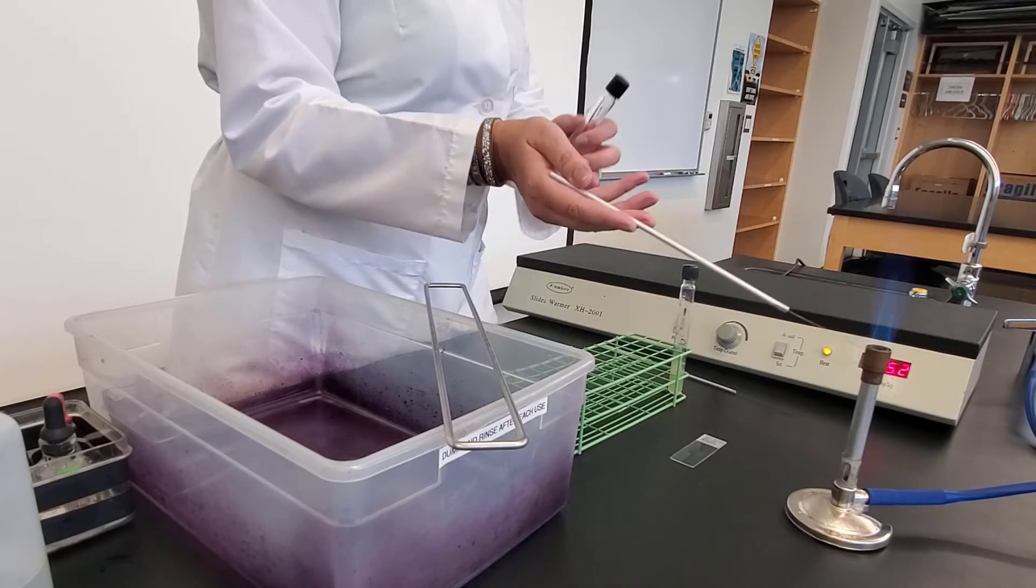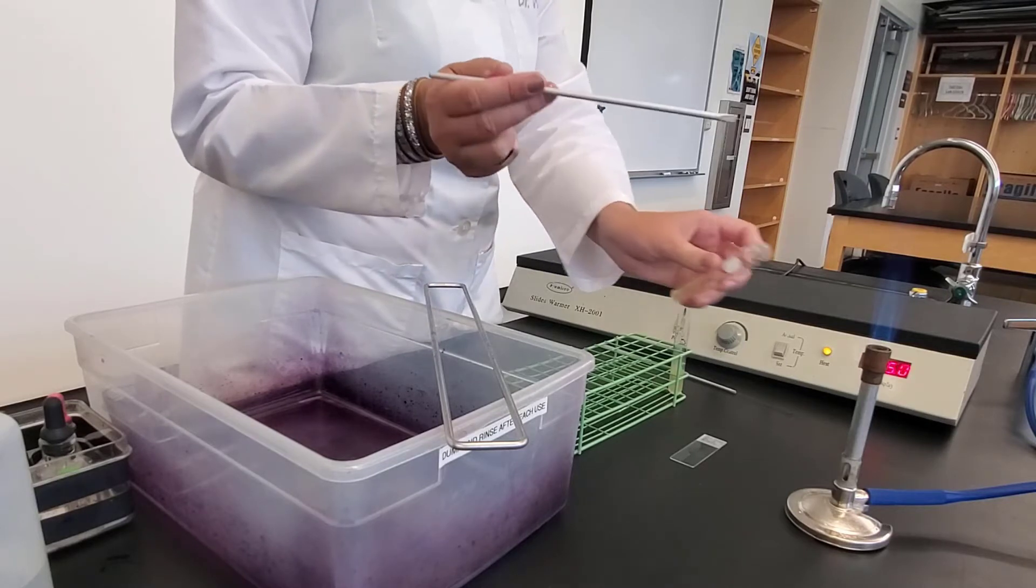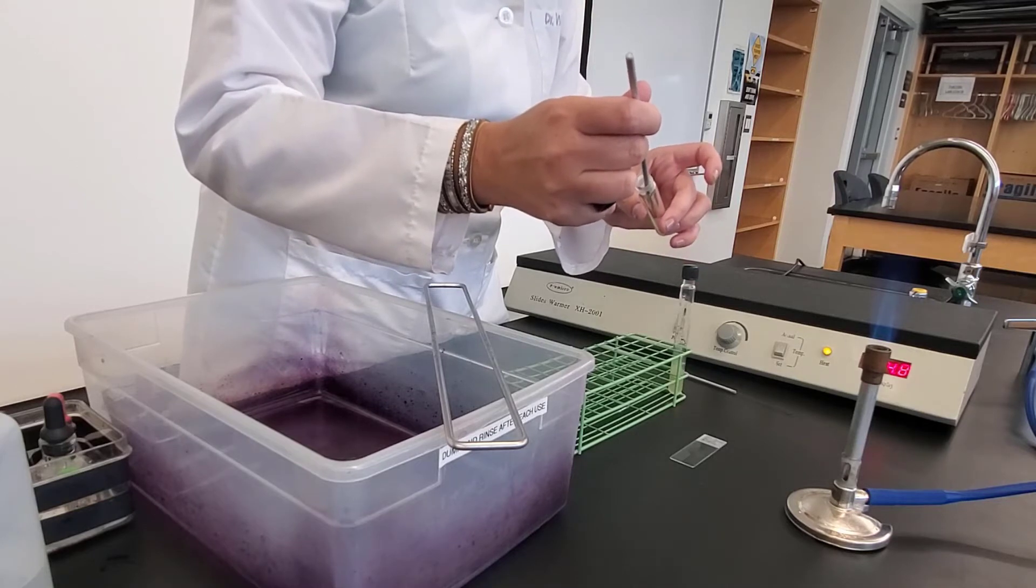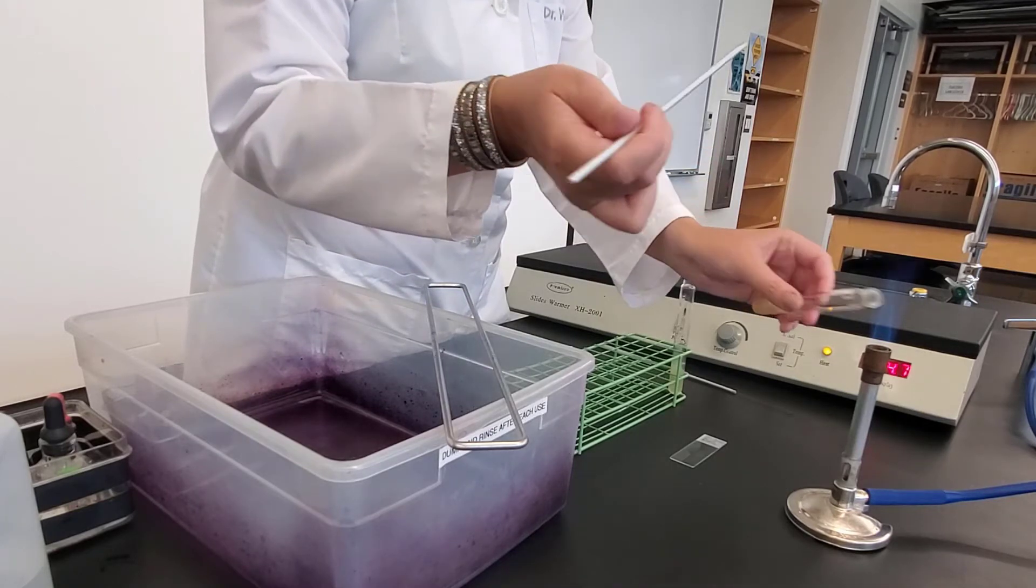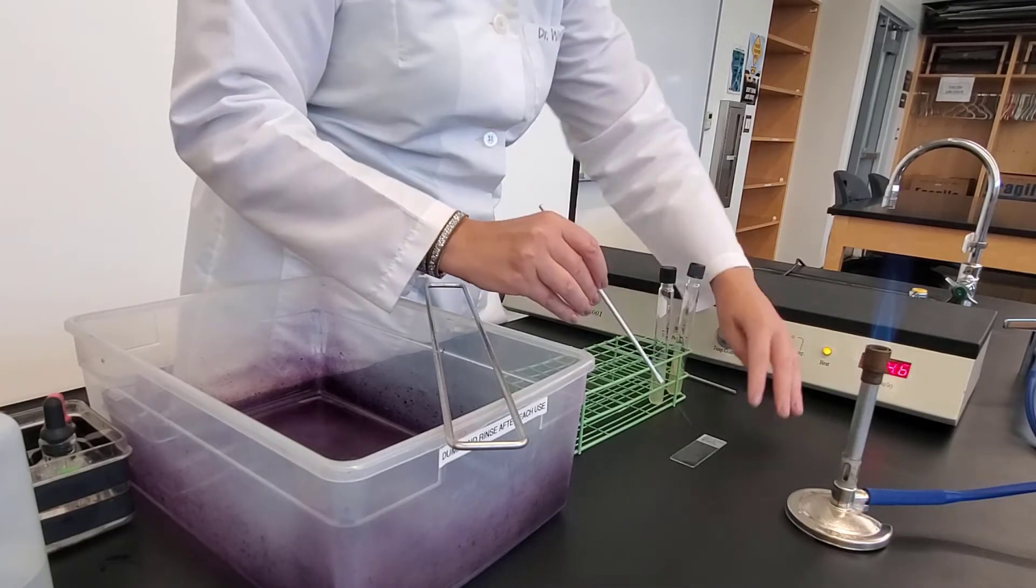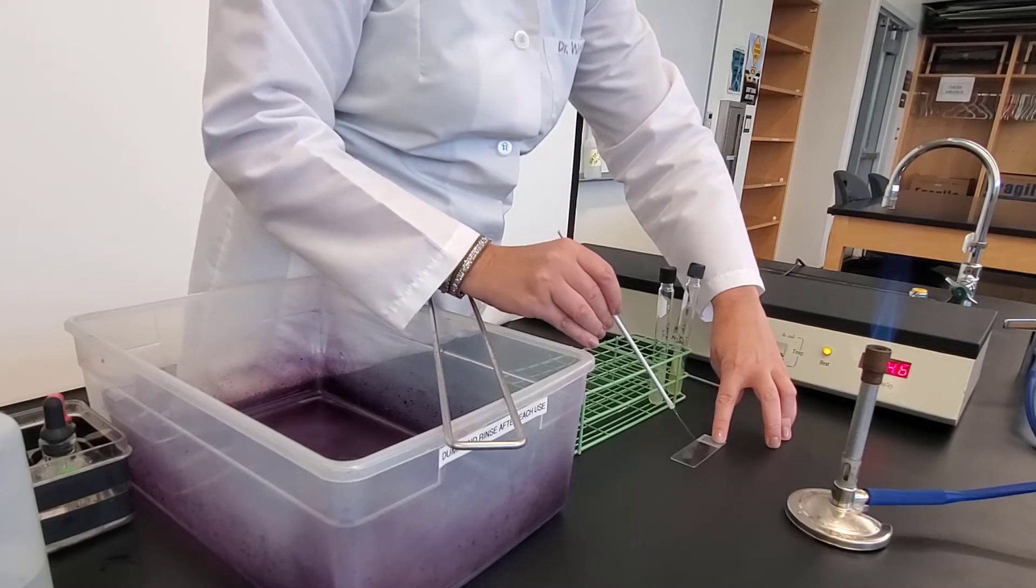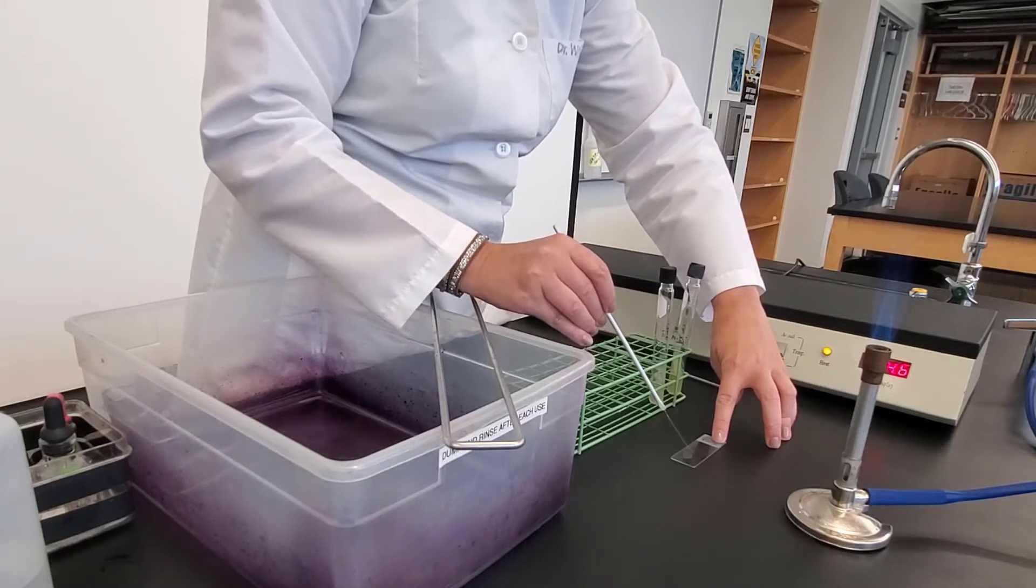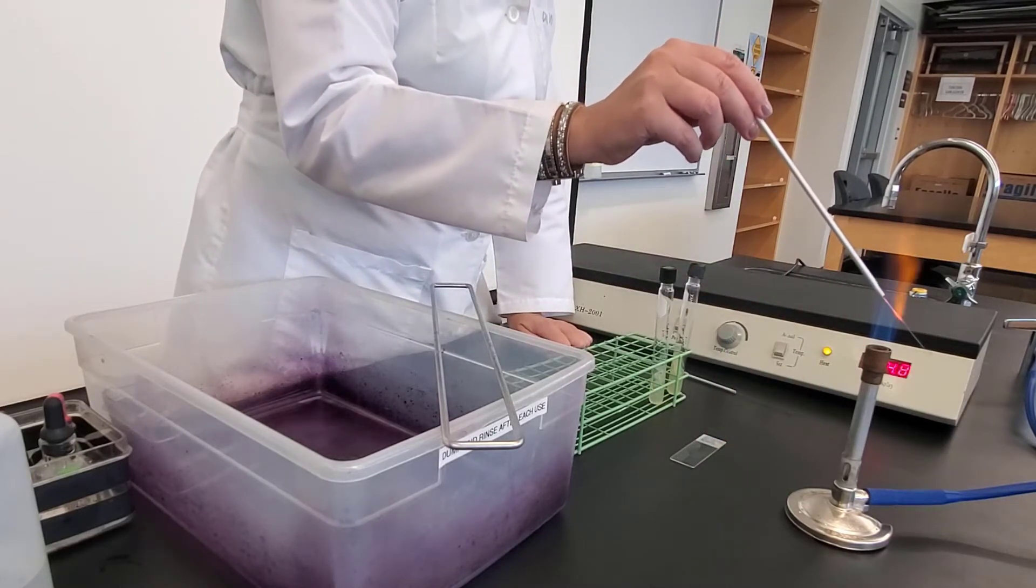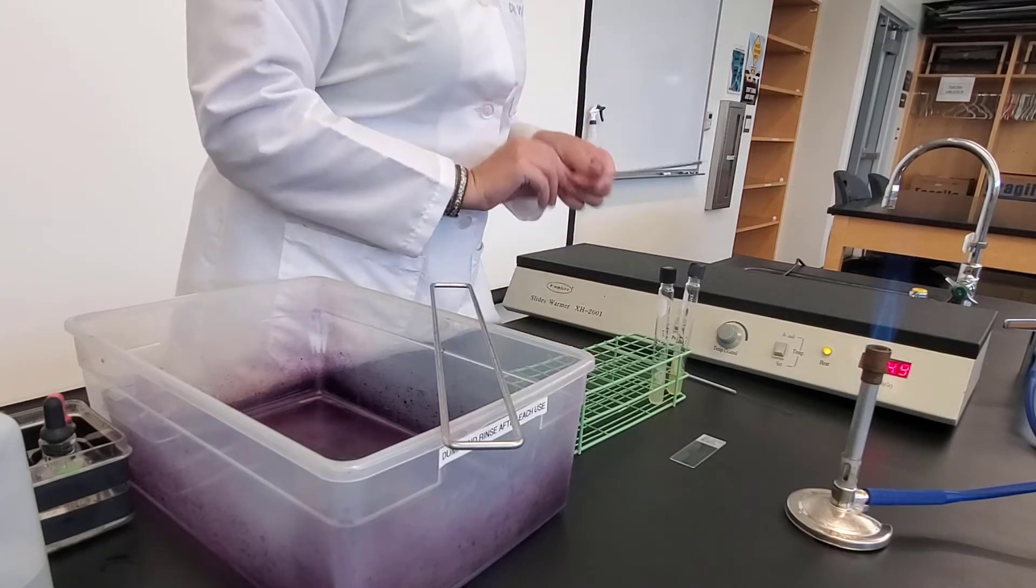So once my needle is cooled, again, I'm going to take the cap between my pinky and my ring finger. Flame it. Go in. Pick up a little bit of bacteria. I don't need a lot. Flame it. Cap. And then swirl it in the water. I'm going to flame sterilize my needle.